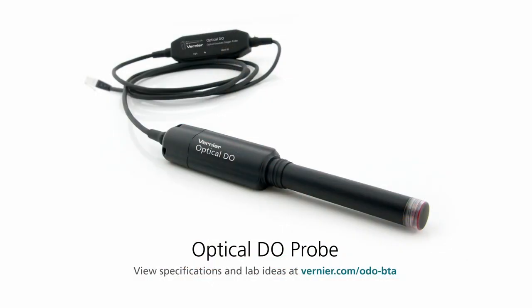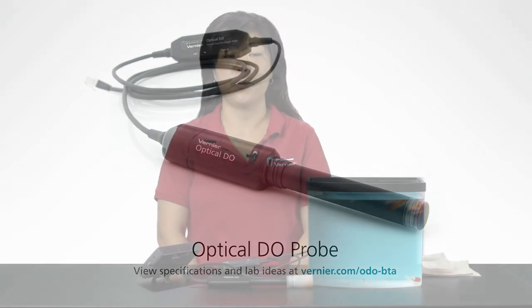Vernier now offers two choices in dissolved oxygen probes: the dissolved oxygen probe and the Vernier optical DO probe. The dissolved oxygen probe is slightly less expensive but requires several setup and calibration steps. The optical DO probe may cost a little more, but it's virtually plug and play. Let's take a closer look at the optical DO probe.